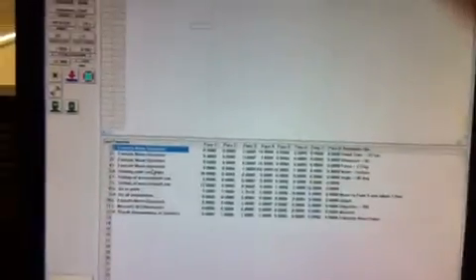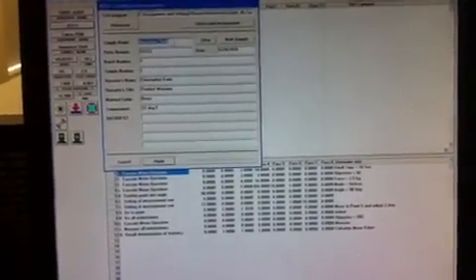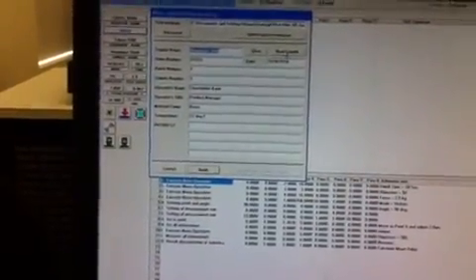which hopefully you can see in the fixture. Okay. And moving back over to the software, to execute our test program, the user would simply move over to the auto button, and then they would key in some sample information, so your sample name, order number, batch number, what have you, and then they would just press the new sample button. As soon as you do that, the software will take over under program control, and automatically we will view the specimen, the bullet shell, on our computer.